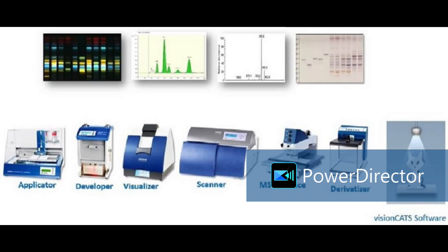Is that possible in GC or HPLC or any other technique? No. Mostly we use closed packed columns for separation. So in that case, after the sample components come out of the column and pass in front of a detector, only then do we come to know what happened and which components are there. But in TLC and HPTLC analysis, we can actually visualize whatever is going on on our plate.